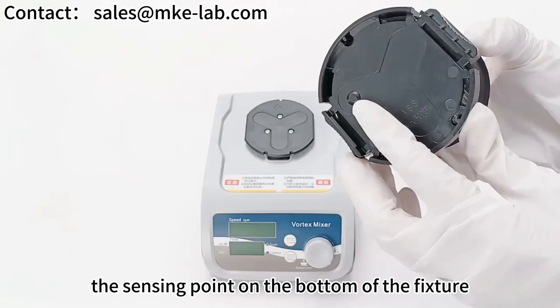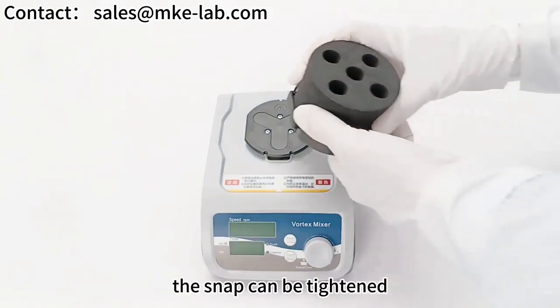The sensing point on the bottom of the fixture corresponds to the sensing area of the card holder. The snap can then be tightened securely.